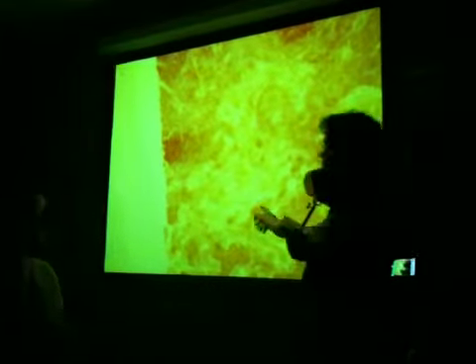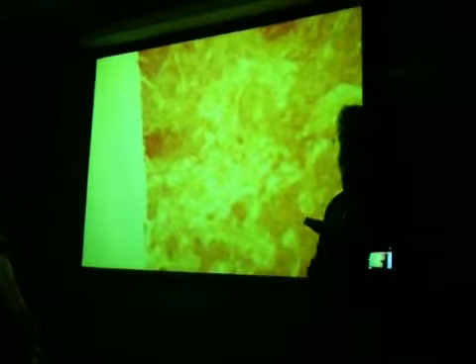These are medullary cords. This isn't the best slide. And you've got sinuses surrounding them in the medulla. Okay? We're going to do this again next week. All right, that's it for the lymph node.